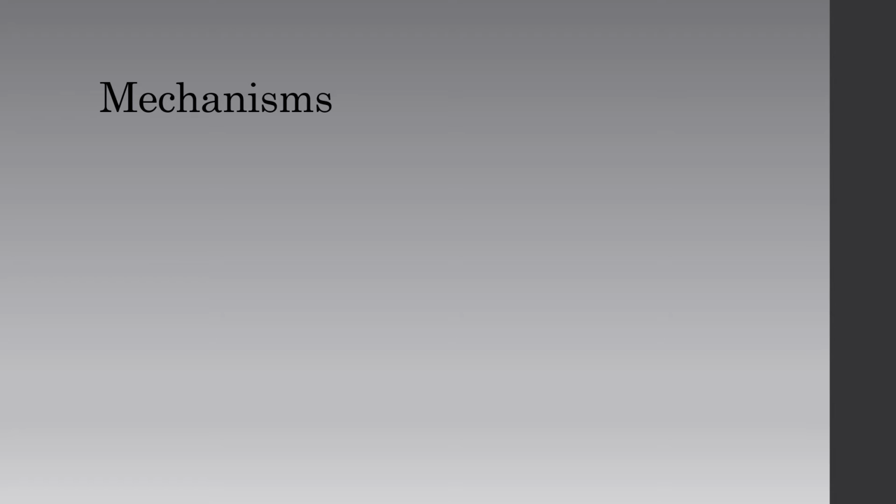So let's discuss two of the reactions that we will be accomplishing in this lab. If you take a look at one of the parts, specifically in experiment 20, in experiment 19. So in experiment 19, we'll be using two solutions. We're going to be using a solution of silver nitrate. Now, silver nitrate is an ionic compound. So typically our ionic compounds are going to be soluble in water, especially our simple ionic compounds that are just a cation and an anion, and inorganic salts tend to be insoluble in most organic compounds.